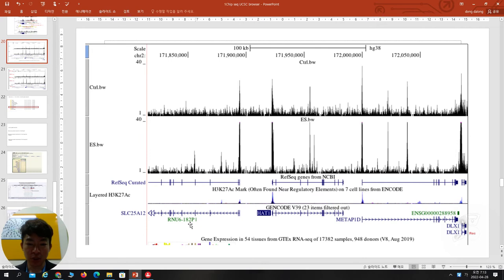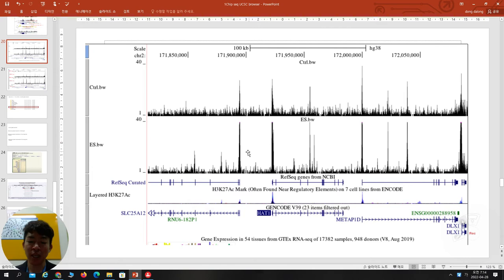Here, you can see this gene going left way and right way, with the reference gene. This thin line is intron and the thicker block is exon. Your expression can be obtained from the exon site, or sometimes the intron site. When you get data from sequencing, they always average across the gene and show it as a certain value. But when you go in detail, they always display like peaks depending on the gene database.